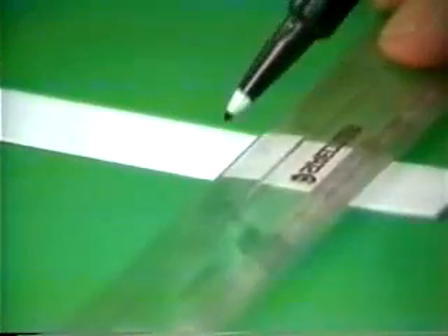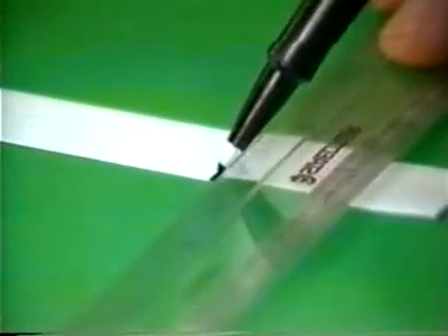A black line is drawn with a felt-tipped pen across the bottom of a strip of absorbent filter paper. The paper is suspended in the mixture of ethanol and water. As the solvent is drawn up the paper, it carries the ink with it.